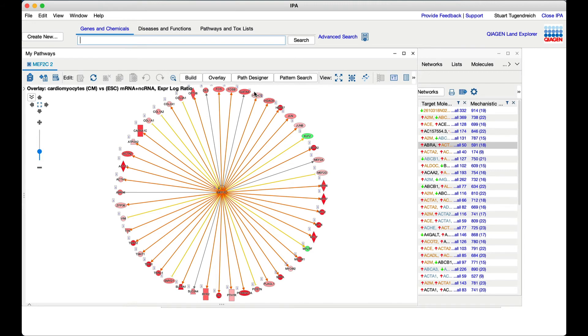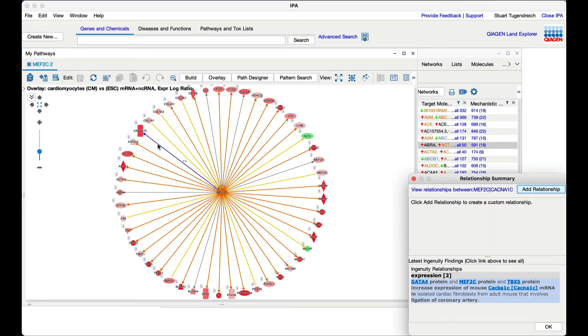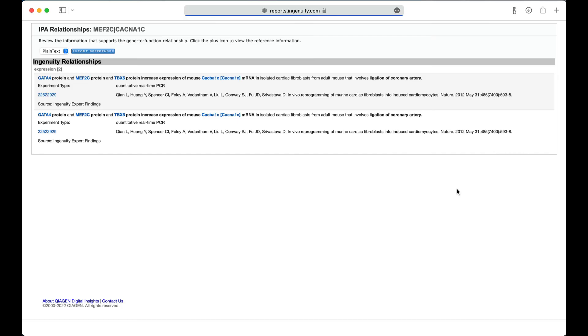To look at any relationship in more detail, just double-click it to get a quick preview, then click the hyperlink to view a page with all the details. These include a summary of the finding that was curated, the citation for the paper, and the hyperlink to go to PubMed to view the full article, if you have access to it.